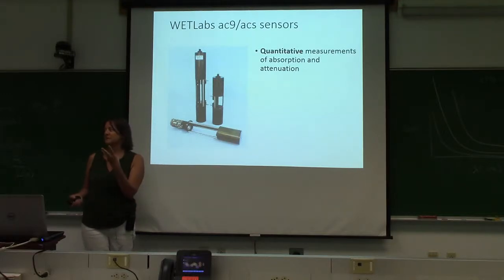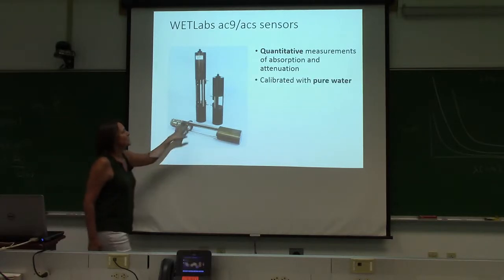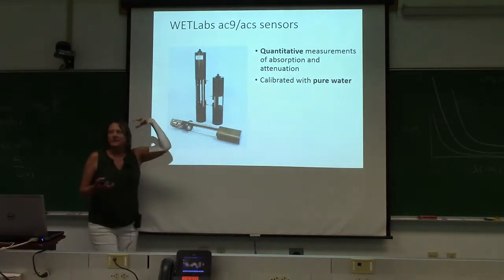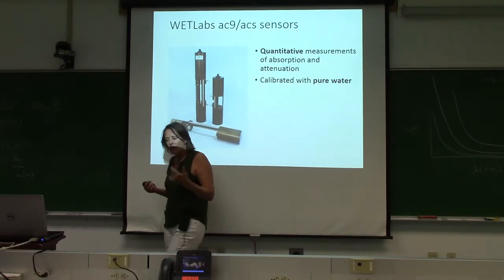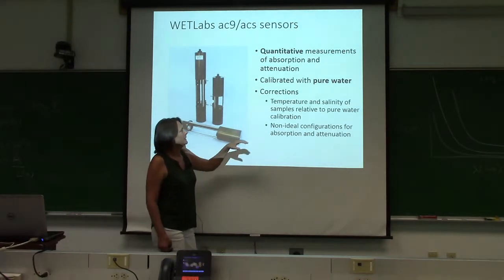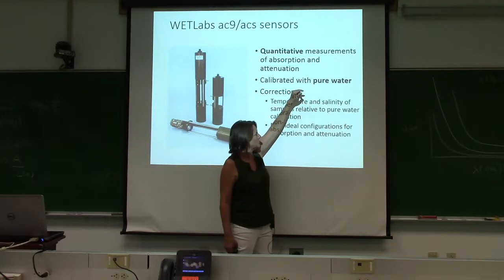So you get 3 measurements in one, although not with closure, because all of your errors in the first 2 measurements go into your error in the calculation of B. We calibrate them with pure water. And so you're measuring the absorption of seawater or suspensions relative to pure water. So your absorption will contain all of the optical properties of anything dissolved, be it organic or inorganic. I already showed you how pure water's absorption properties change as a function of temperature, so you have to correct for temperature differences between your calibration water and your sample.